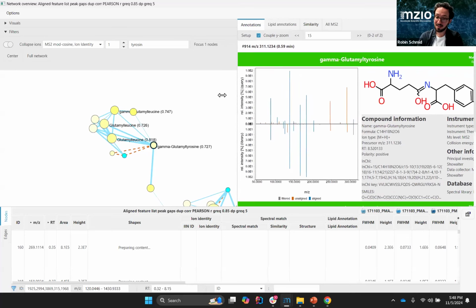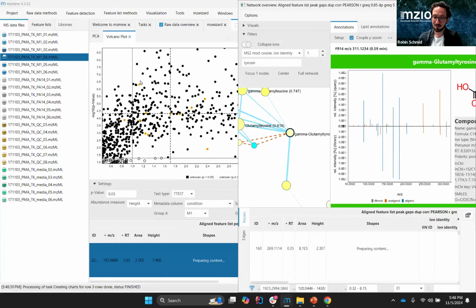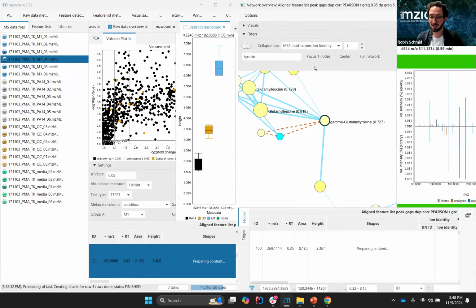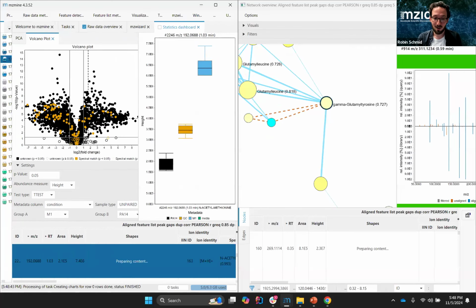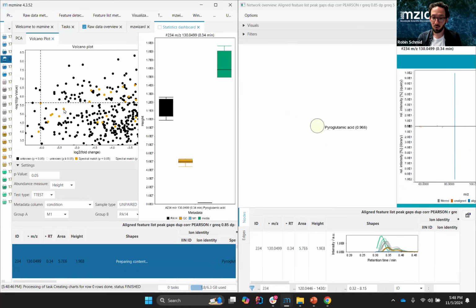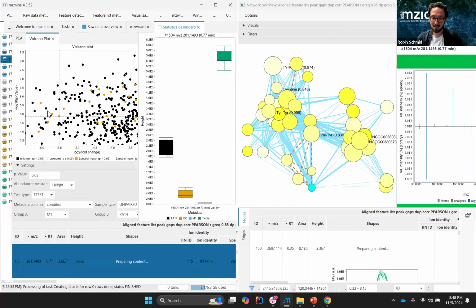And one nice way, which is very hard to visualize at this moment, is that I can shift the network visualizer onto, let's say, my second screen, which I cannot do right now. And I can use here, for example, the volcano plot. And if I select any node in the volcano plot, it is going to pull out the neighborhood of this feature that is selected also here in the table.